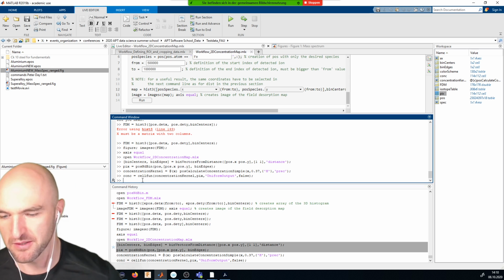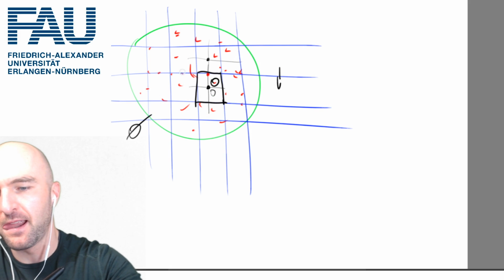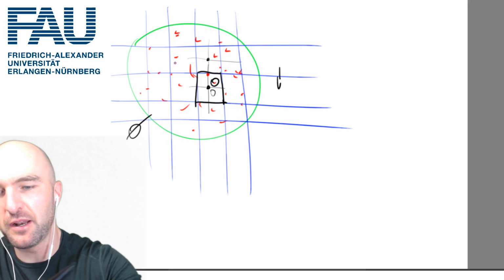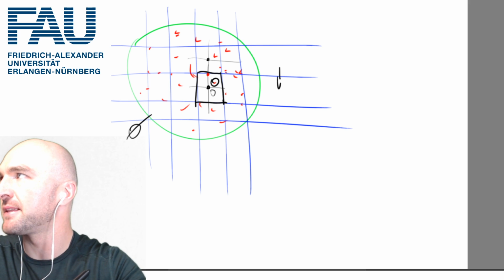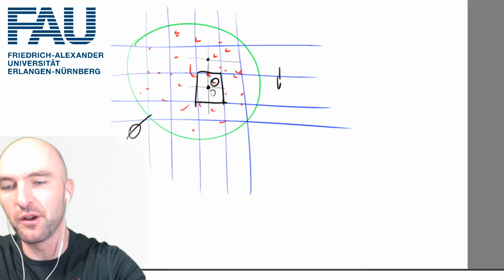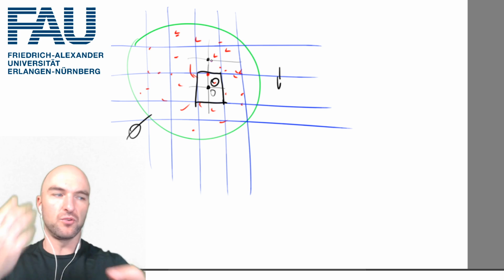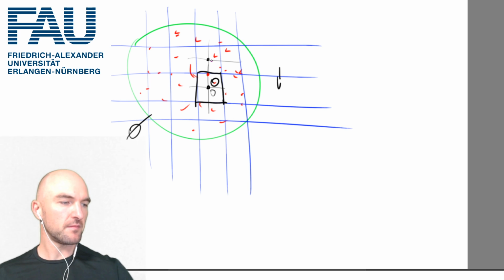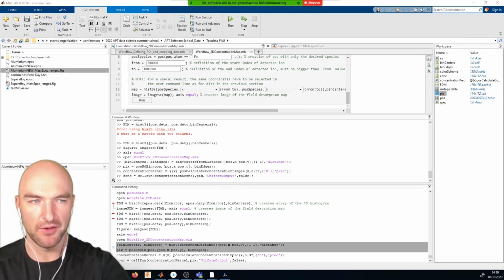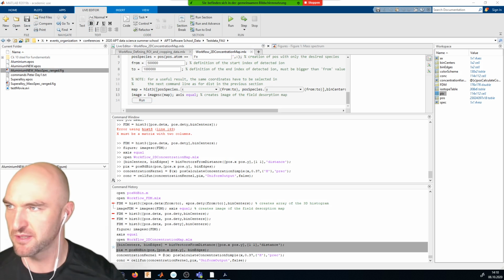If you have reasonably good statistics, then this is not as much of a concern, because you can imagine that if you have a lot of dots here and you move that line by a tiny bit, this one might jump from this voxel to here, but another one will jump the other way around, according to whatever density you have here. This is definitely something to keep in mind, especially if you have data with relatively low statistics.